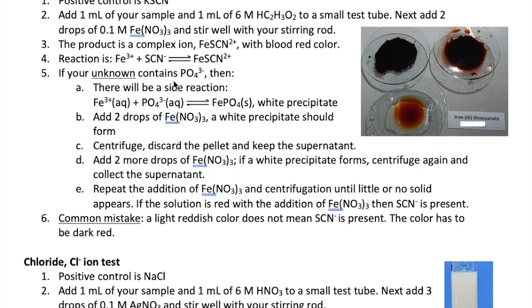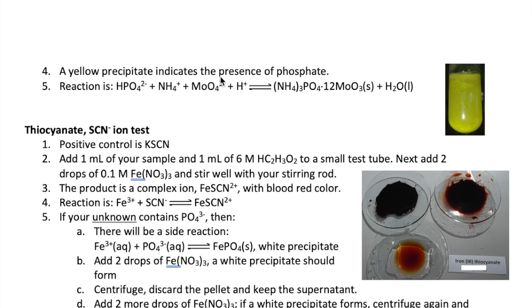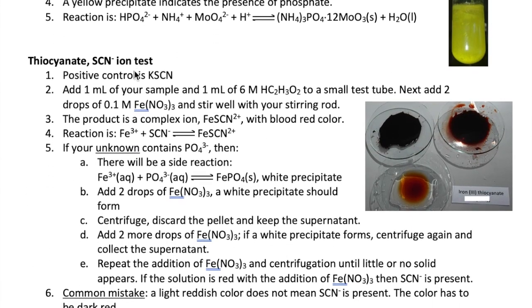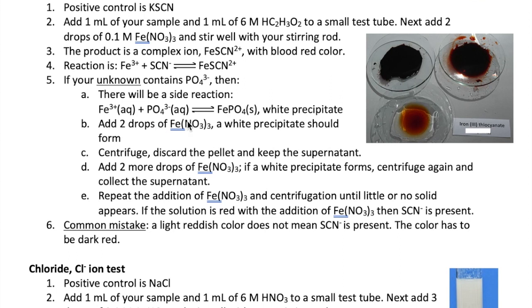Now, there's a potential problem with this test, which is if phosphate is present. Recall that in the previous test, you already figured out whether phosphate is present or not in your unknown sample. So if phosphate is present, then when you add your iron nitrate, instead of getting a blood red solution, you're going to see a white precipitate instead. The precipitate is iron phosphate, and it will interfere with your detection of thiocyanate. So, you'll have to remove all the phosphate first before you can test for thiocyanate.